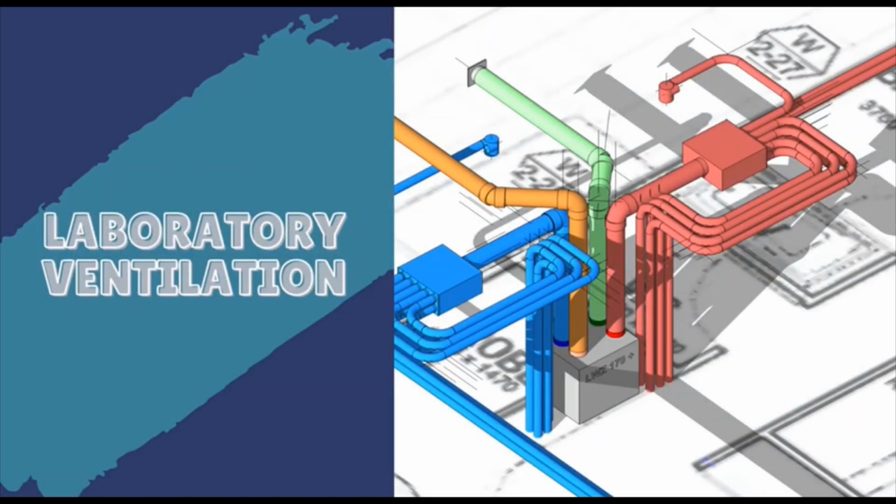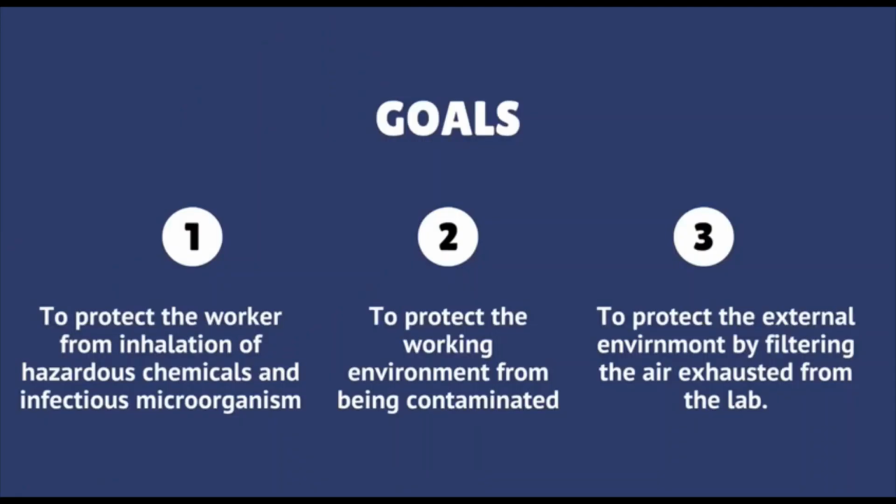Lab ventilation. Lab ventilation is important because it protects the worker from inhalation of hazardous chemicals and infectious microorganisms, protects the working environment from being contaminated, and also protects the external environment by filtering the air exhausted from the lab.